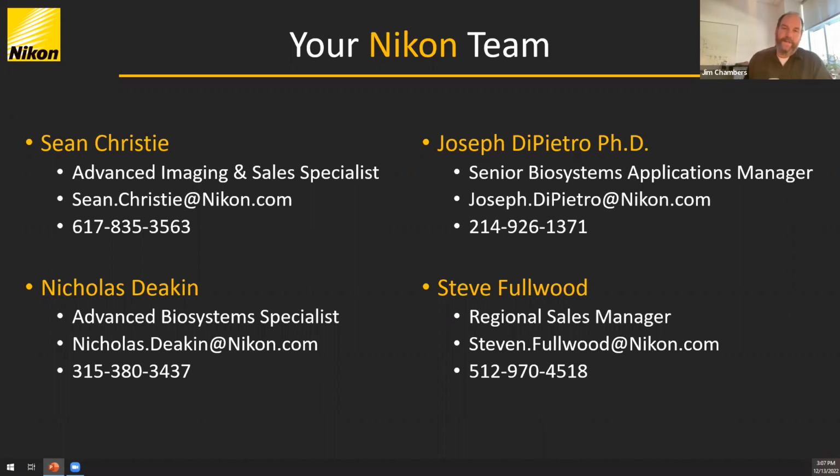And if anyone has questions about the offerings that we have, you can just email me. Like Joe said, we have Jobs on, I think, six or seven of the microscopes. So at the very least, each modality: wide field, spinning disk confocal, and scanning confocal, as well as some of the other scanning confocals. And we have GA3 also on those, as well as offline workstations, including the AI modules and deconvolution and stuff like that. So I think pretty much everything you talked about, we have here today.